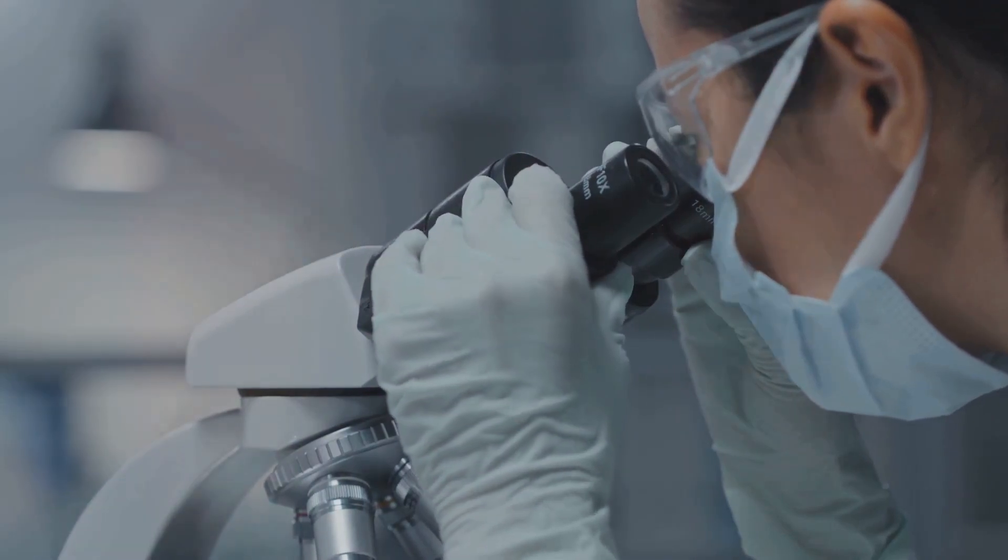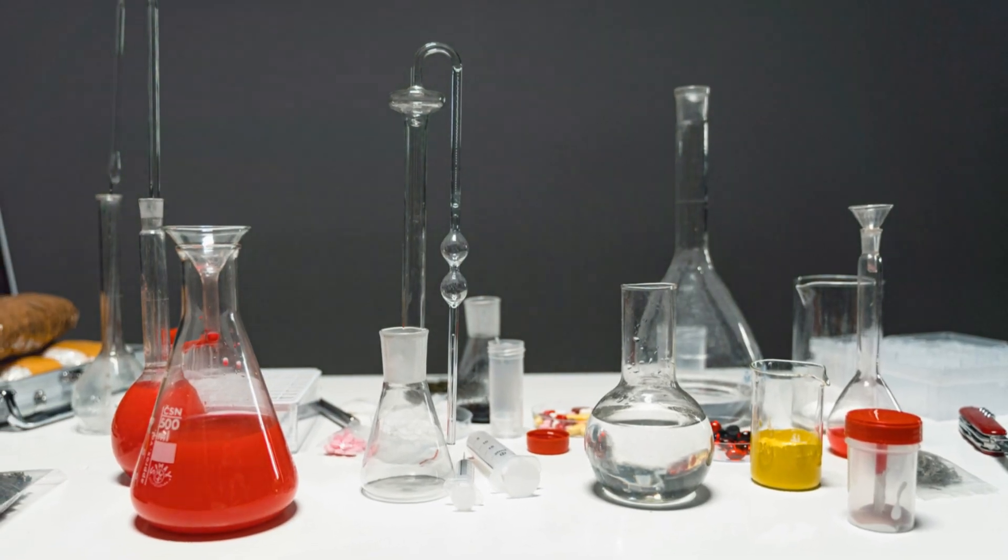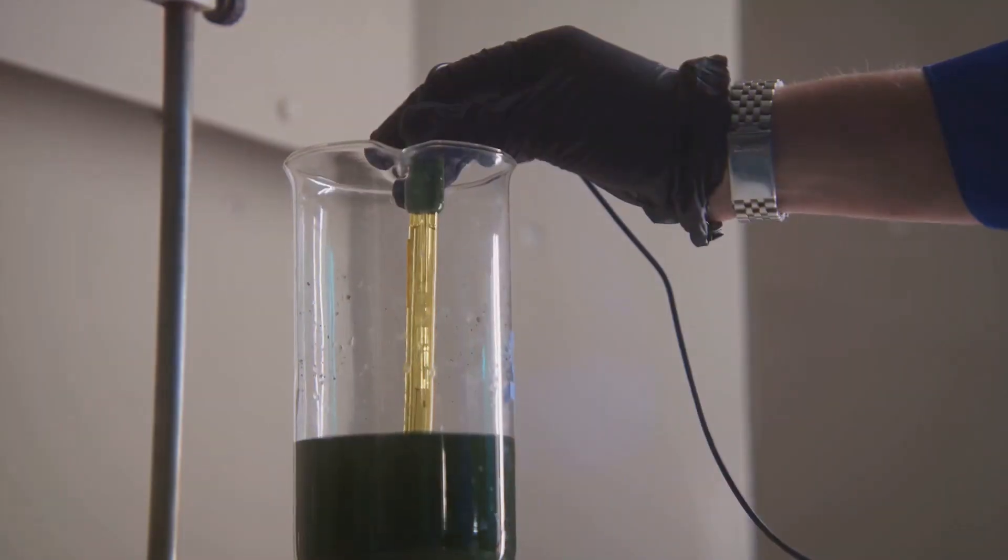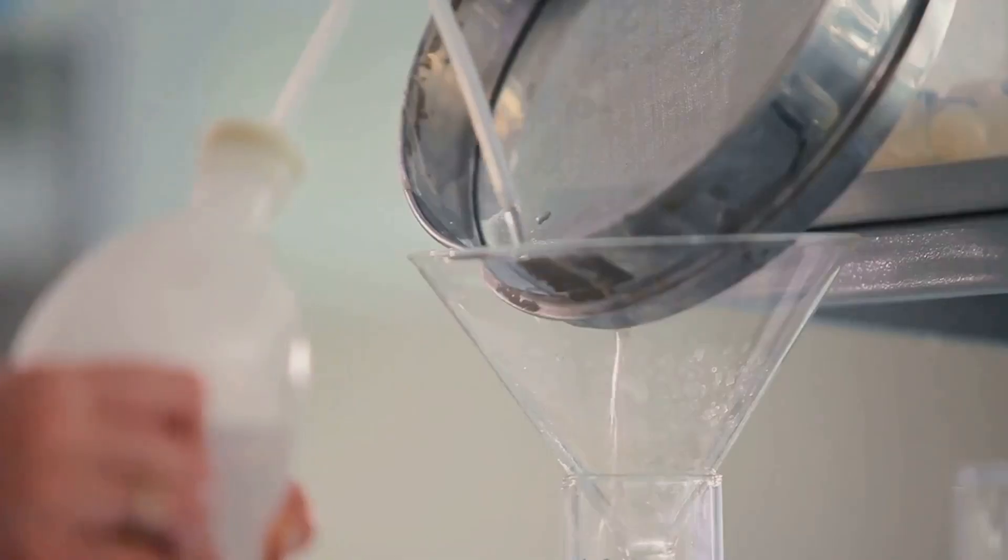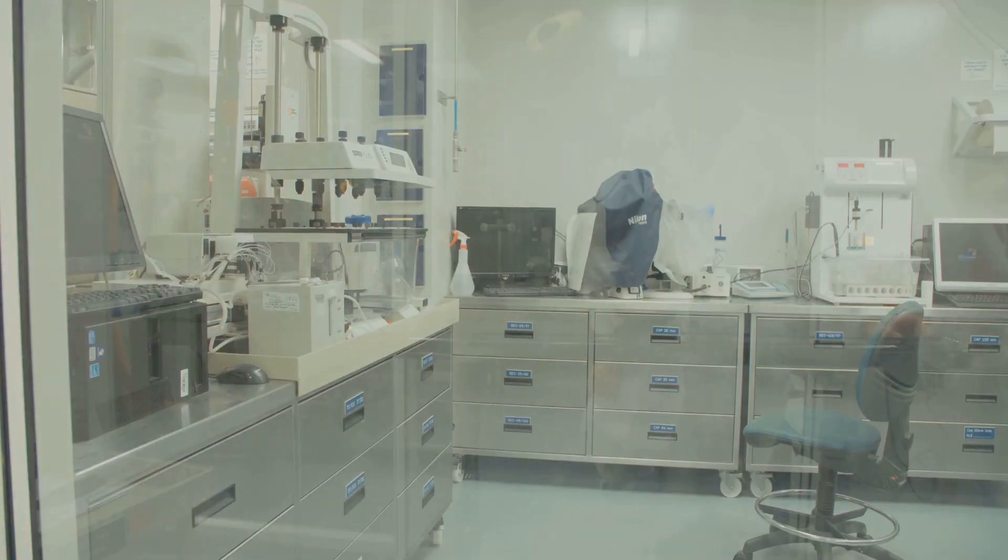Now that we're all decked out in our safety gear, let's gather the tools we'll need to extract that precious gold. Don't worry, it's not as complicated as it sounds. First, we'll need some basic chemistry equipment: glass beakers and flasks to hold our solutions, a glass stirring rod for mixing, and a funnel and filter paper for separating the gold later on.